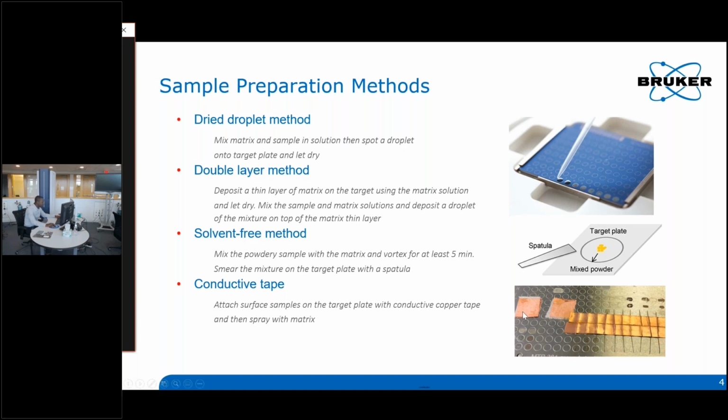This is also another example. We had two pieces of clothing that we were looking at, one being a control and one being a finished product, and you could easily analyze it off of the surface with MALDI. We also have TLC adapters and glass slide adapters, which I'll show you in the next slide. And towards the end, if we have time, we'll look at our TLC MALDI technology, which is proprietary to Bruker only, that helps you pair TLC separation with MALDI for more detailed information on your mixture and your separated components from the TLC experiment.